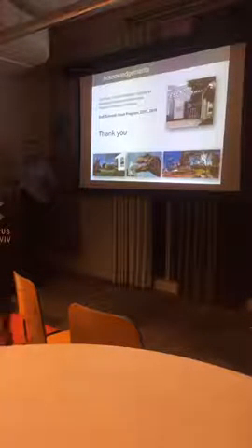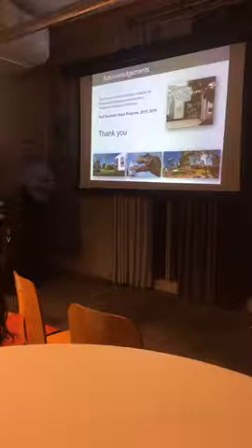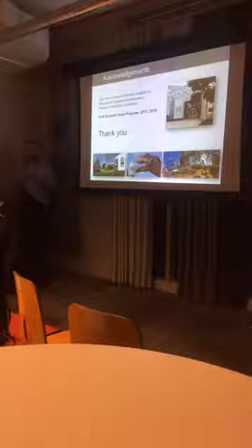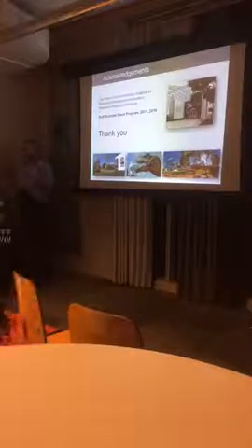So 30 frames is enough to make one image, and then we take, let's say, 500 or sometimes 600 images to get a very nice laser speckle image as a result. So 10 milliseconds for the brain, 50 milliseconds for the mouse ear, 30 frames to get one image, and then we average, for example, totally 300 or 600 images.